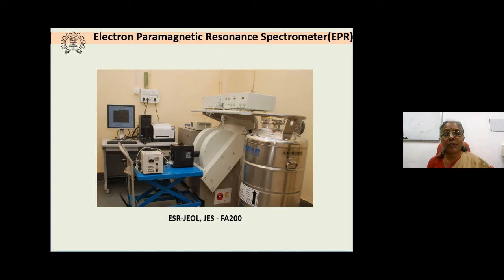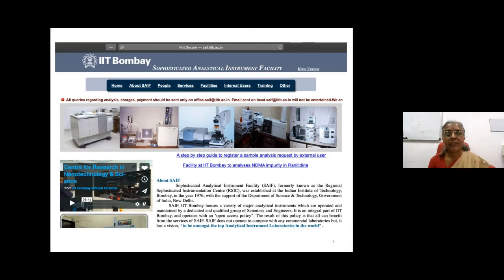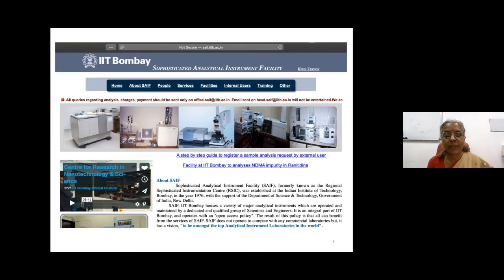This is our EPR spectrometer JEOL model in the lab. The blue attachment is our UV unit. This is our SAIF website — Sophisticated Analytical Instrument Facility — regularly updated by our IT team. In the last few months we have updated quite a few things and made them simpler from the user's point of view: submission of MSDS, payment, and document registration are all simpler now.